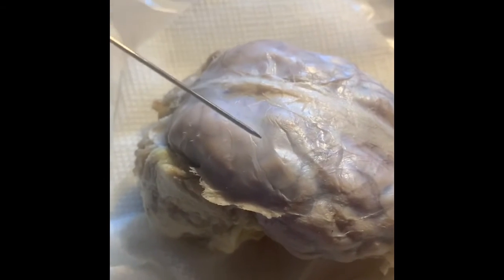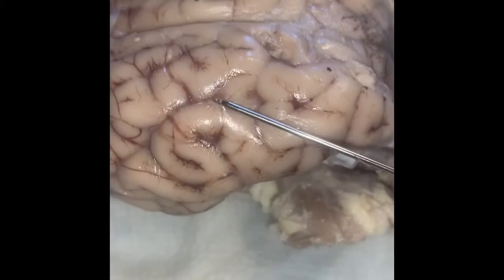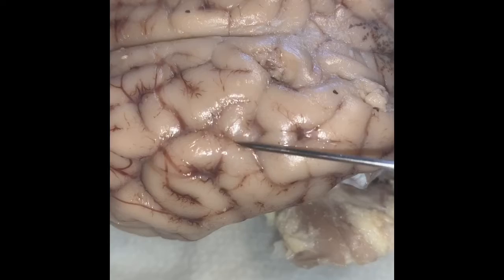Okay, I just wanted to make a video right away before I try to remove it. This is the dura mater that is still attached to my sheep brain. It might be a little hard to see, but this is the arachnoid mater that I am underneath here a little.